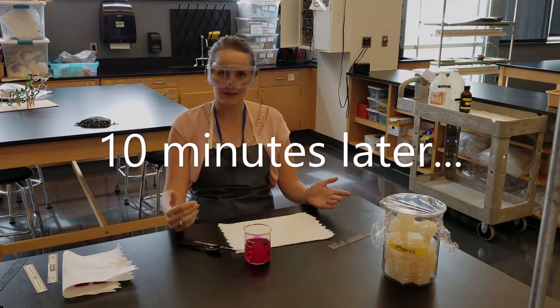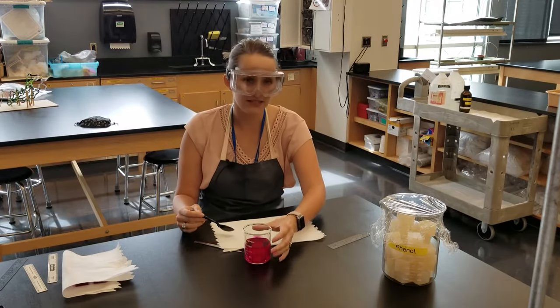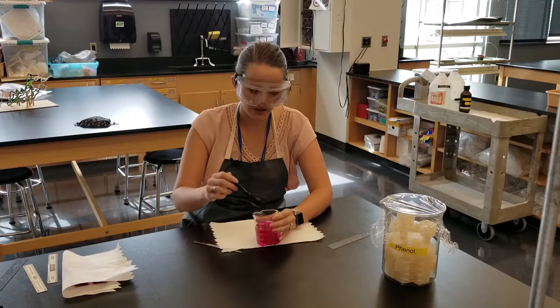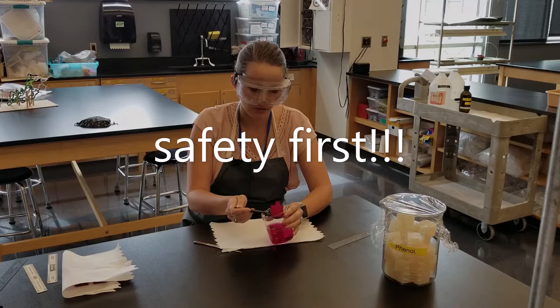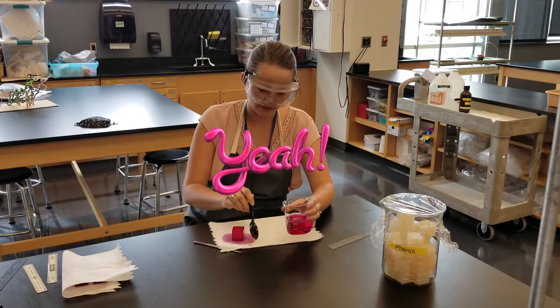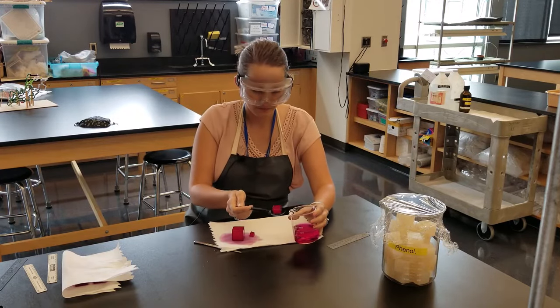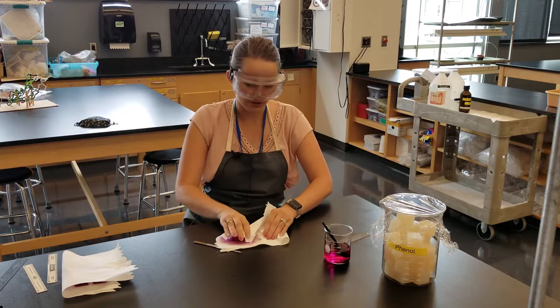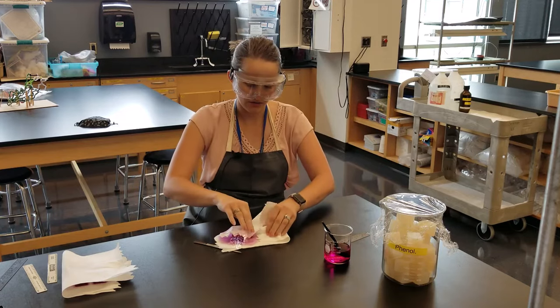We set a timer for 10 minutes and our 10 minutes is about up. I'm going to take the cubes out of the NaOH using a disposable spoon so I don't get anything on my hand. Before I do anything else, I'm going to blot them dry a little bit so the liquid doesn't go anywhere. We've got a gorgeous color.